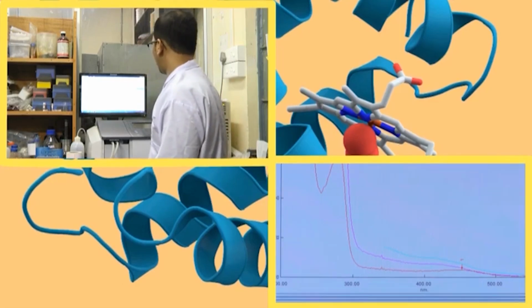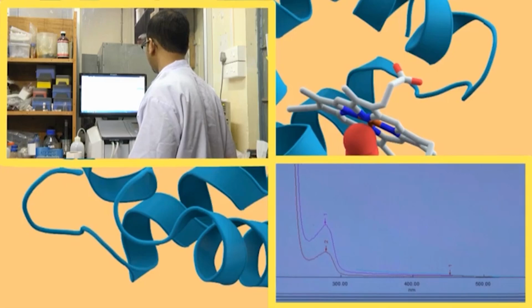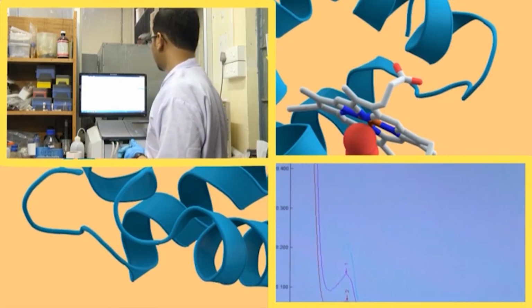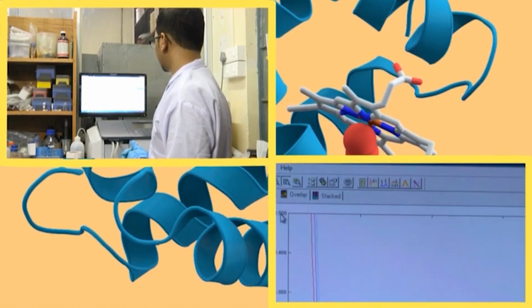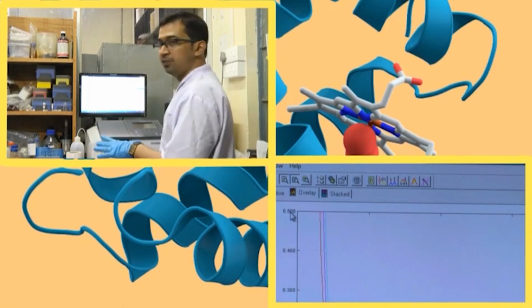So, it is increasing. I am again changing this value to 0.5. So, again it increases as we have seen previously.